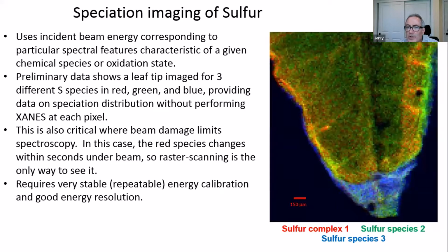Richard, you just put up a question. Can you turn on your mic? Sure. I have a question. I have trouble saying what I mean, but there are detectors which have a hole in the middle, so you can put excitation radiation through the detector, and then your detector is flat to the sample, and therefore you have a highly increased solid angle of detection. Did you consider using such a detector?